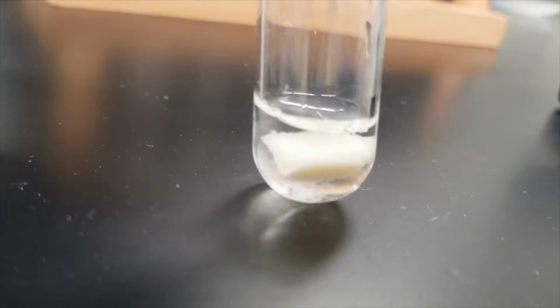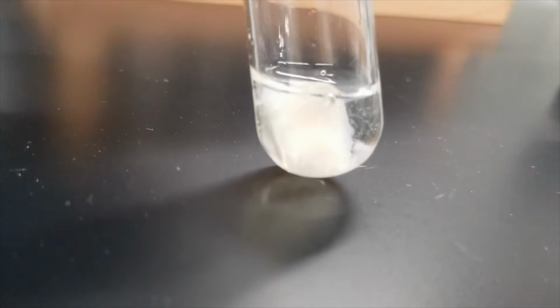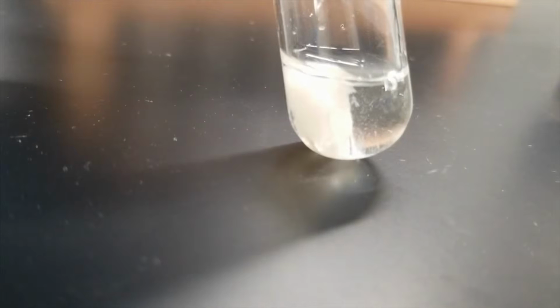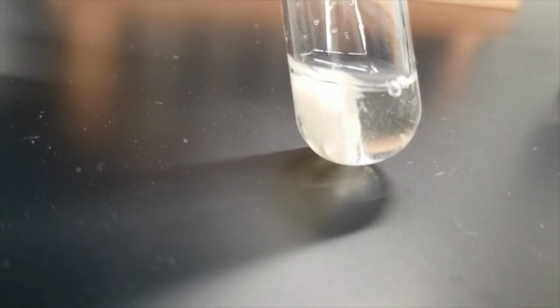I'm going to shake this up to kind of get rid of those bubbles, hopefully. Just disrupt those. I guess I'm making more bubbles there. There we go. Still a bubble or two that's left on the surface, but the fact that those bubbles aren't rising and dissipating tells you that's not oxygen. That's just trapped air. You can see the little bits of flakes in there. Those are flakes of potato, not actual oxygen gas. If they were bubbles of oxygen gas, they'd be rising up to the surface. They're just sinking to the bottom because they're potatoes.